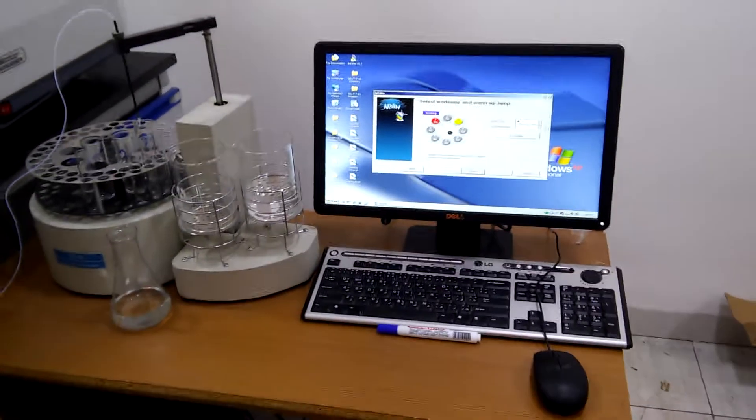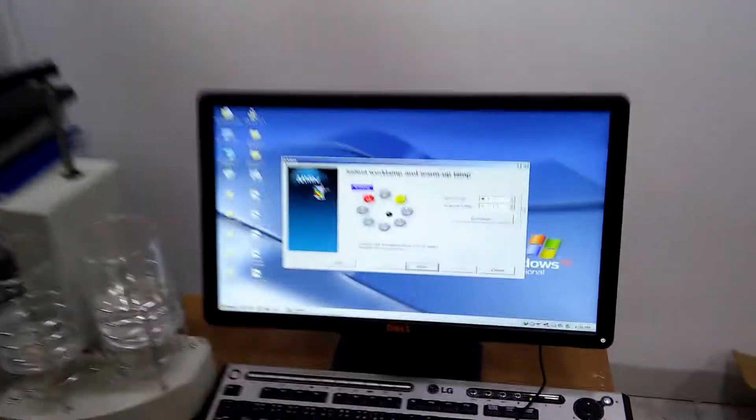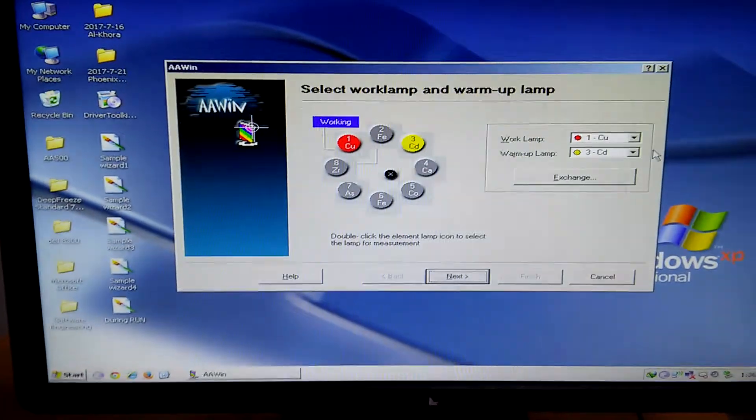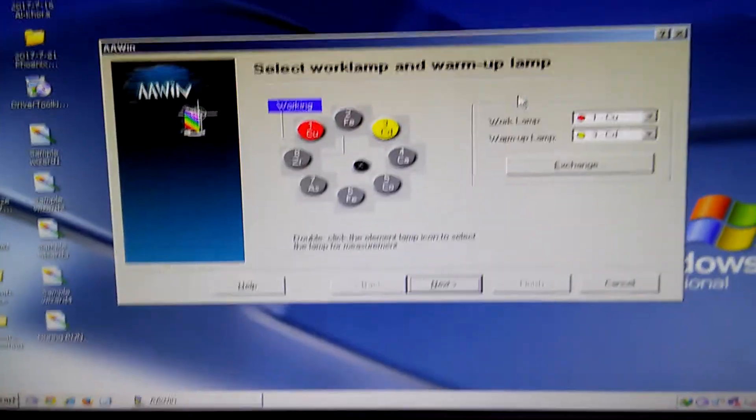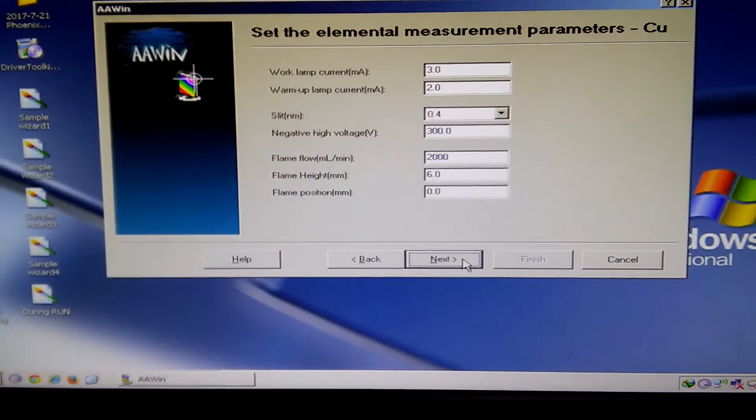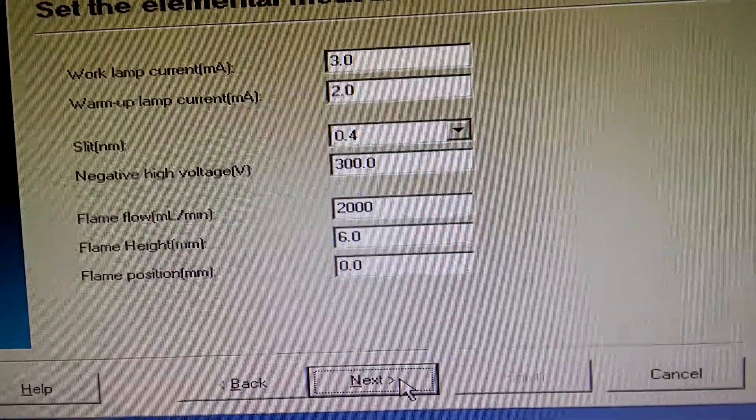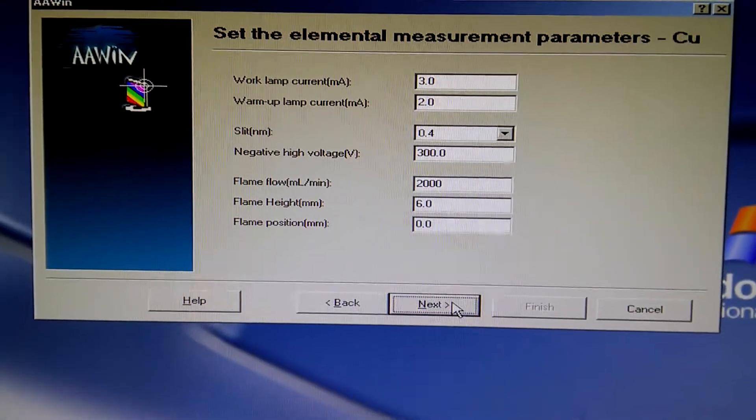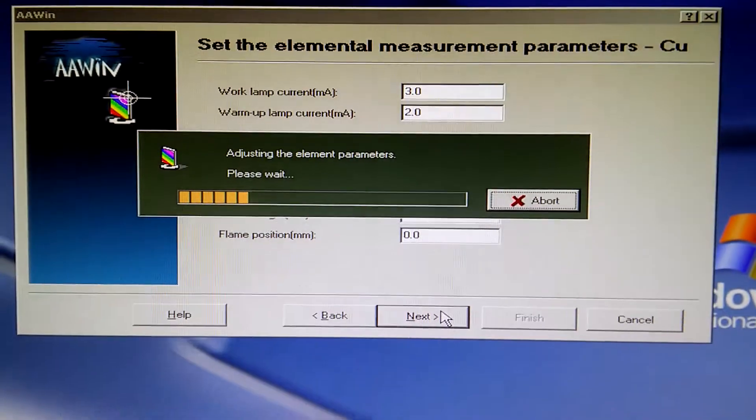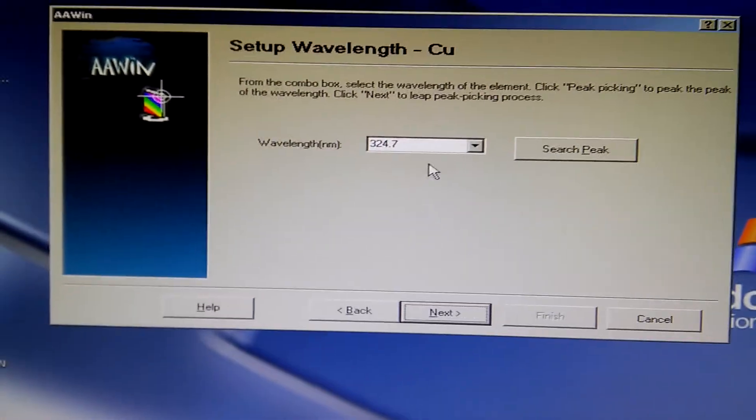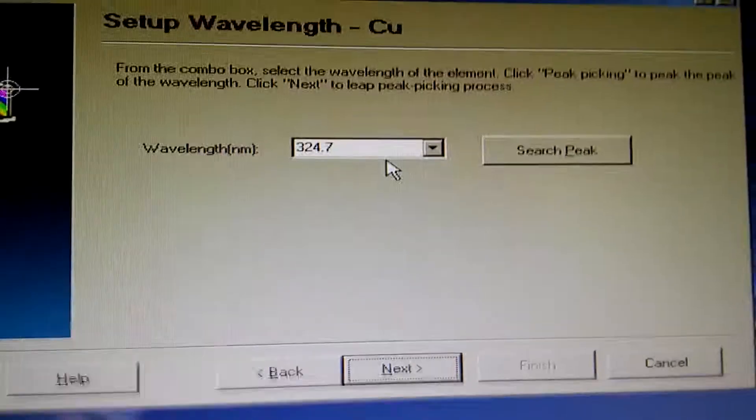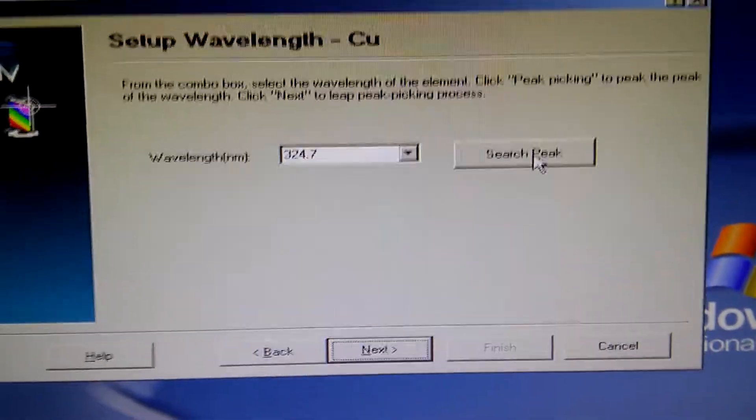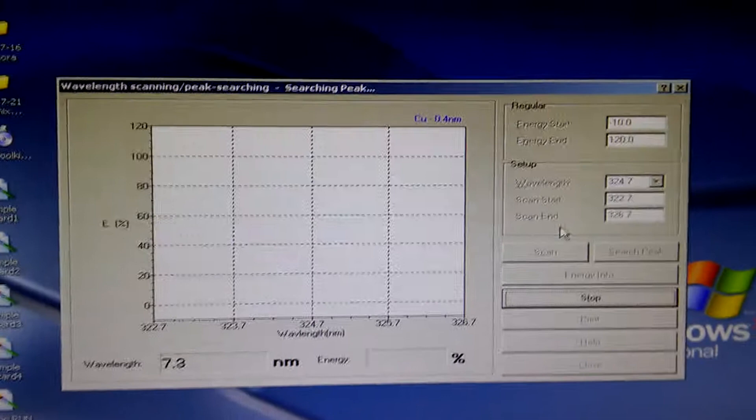Hello again. The initialization step has completed successfully and we have this panel. Now press next. These are the default settings for the hollow cathode lamp of copper. Press next again and this is the wavelength used to determine the copper in the samples. Now press search peak and wait.